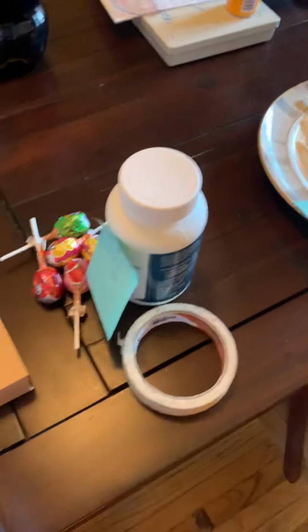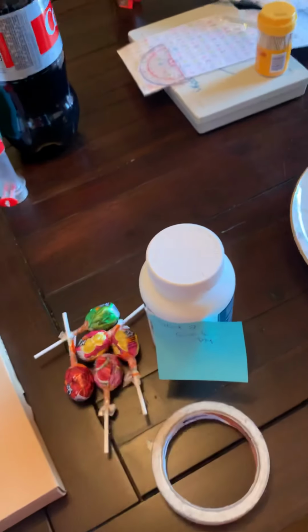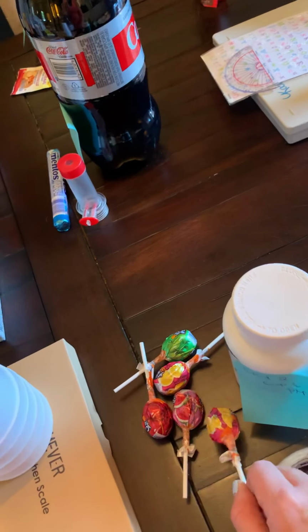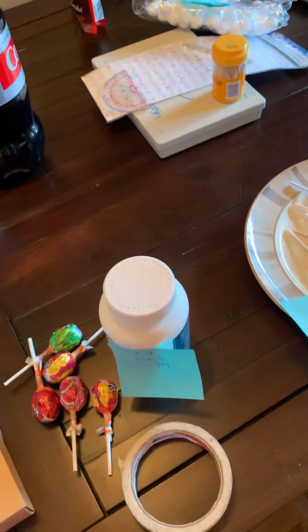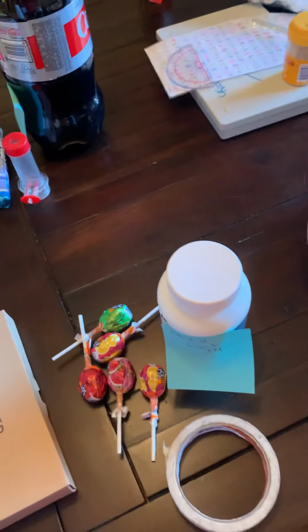Then we're going to get to a demo that I'm going to do only because the chemicals are hard to get. So I have sodium hydroxide and I'm just waiting for some potassium permanganate, which will make it nice and purple. And when you add sugar to it and you stir it, the manganese in the potassium permanganate changes all different colors. So you see a rainbow over a minute of all different colors, and the lollipops have nothing to do with the color. They're just a source of sugar. So that one I've never done before. So hopefully it works, and that will be fun.